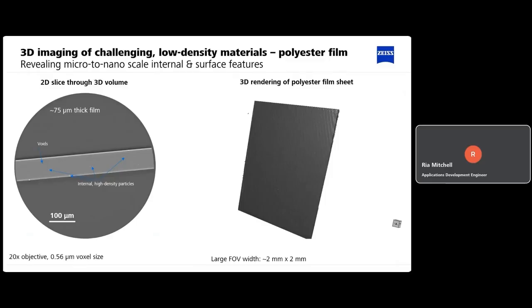And they're so small, usually less than 10 microns, but we're able to pick them up and image them with 3D microscopy. So I've got a short video here that I'm just going to play, which shows not only the surface features of this film, but also those internal particles. I might just stop talking through that video playing because I'm not sure my internet would cope, but we'll see how we go.